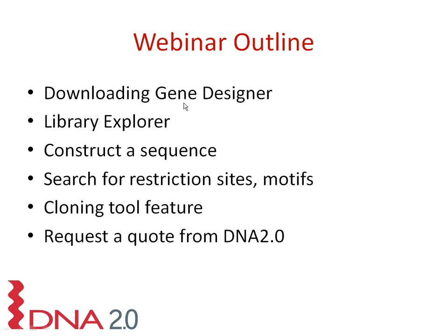In this webinar, I will show you how to download Gene Designer, go over some of the elements in Library Explorer, construct a sequence, and do things like search for restriction sites and motifs to demonstrate the capabilities of the software. I will show you how to use the cloning tool feature to perform in silico cloning, and then finally I will show you how to request a quote from DNA 2.0 for the construct that we just created. So let's get started.